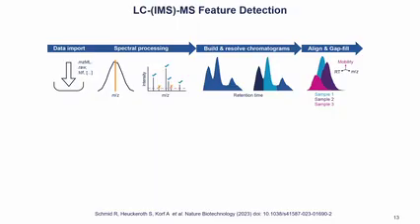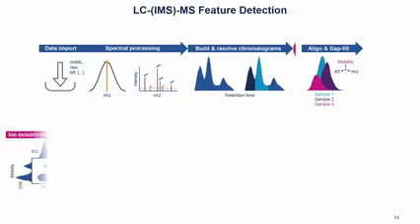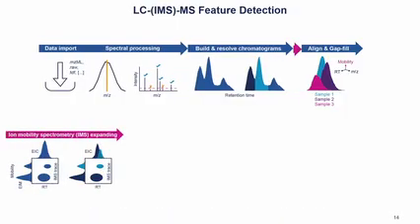And then find your peaks, and then align the peaks into an aligned, what we call a feature list. Now, if you include ion mobility, that means you have to add an extra step there, and that's what we call ion mobility expand. IMS expanding, yes. So you have to expand your features into the ion mobility dimension.